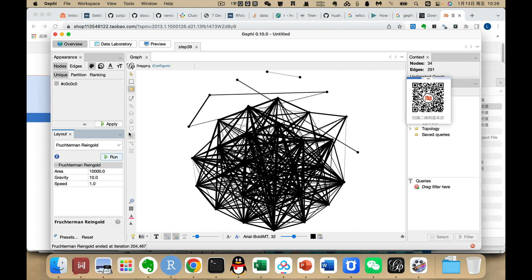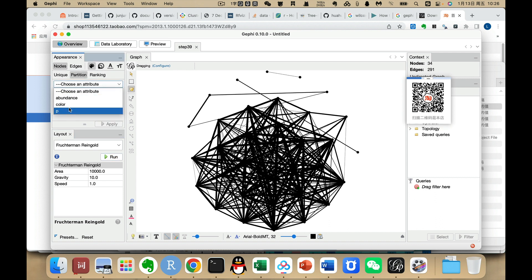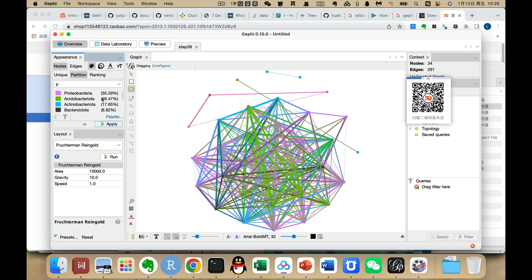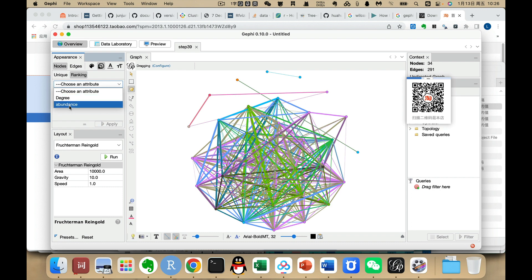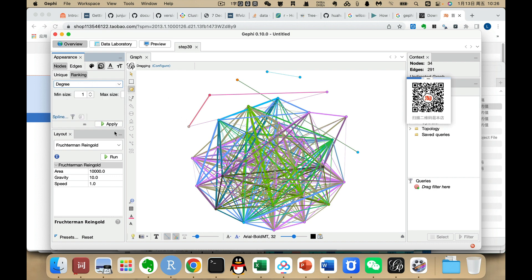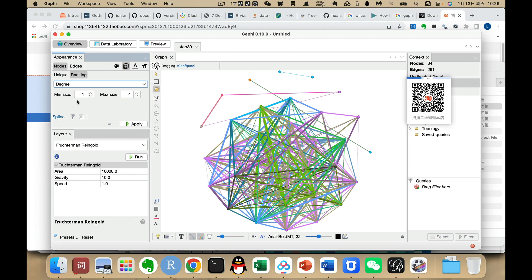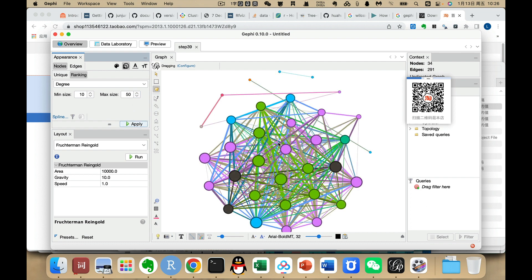Next, we can set the colors and size. We go to the Appearance panel and use Partition for colors, selecting the phylum column and clicking Apply. For size, we use Ranking. We can use degree or abundance — previously we calculated the mean abundance of each node. Degree represents node importance within the network, so we can use degree first.